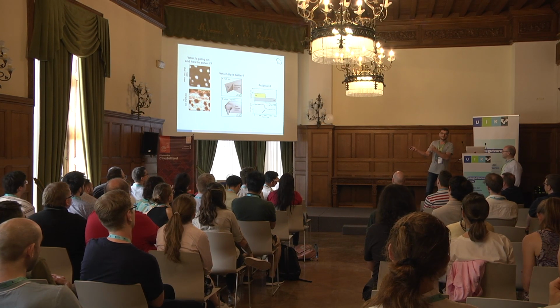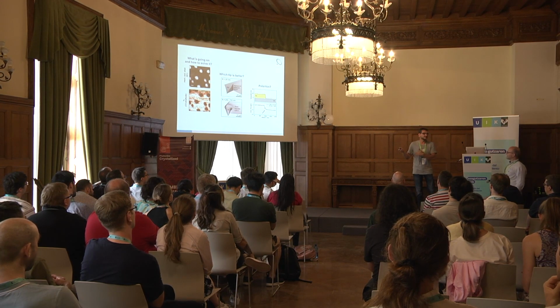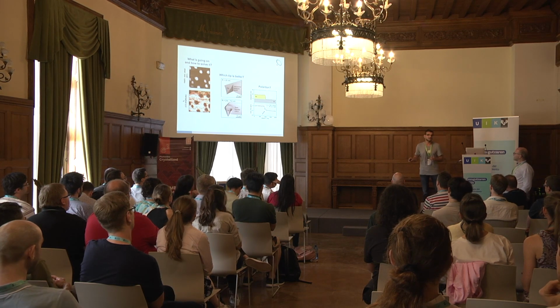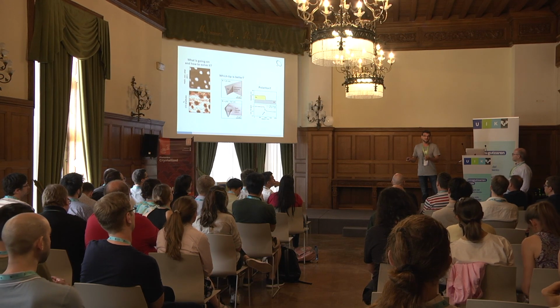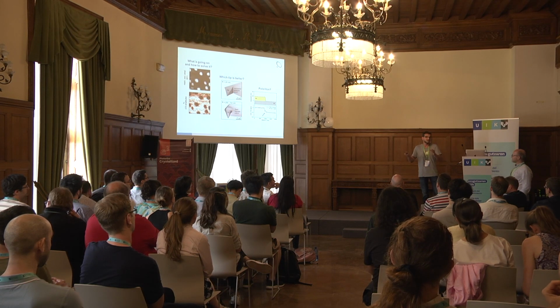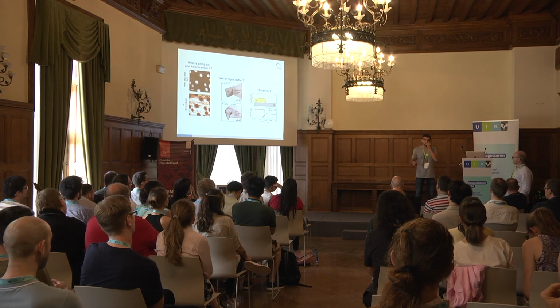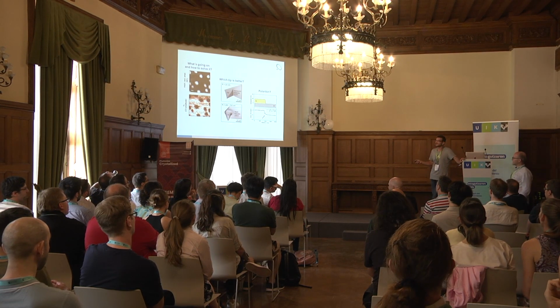Okay, let me refine this. Maybe it's a little bit unspecific, of course, in terms of near-field signals. So which gives you the better near-field signals, let's say better signal to noise? I think we all agree, I don't want to make this a quiz, sharper tips give you more field enhancement, correct? You want to have the sharpest possible tip, because the sharper the tip, the more field concentration. And the signal, one knows roughly, scales with the fourth power of the field enhancement, at least in TERS, right? So a sharper tip should be better. That's at least what I discussed a lot with Fritz. And so let's vote for it.